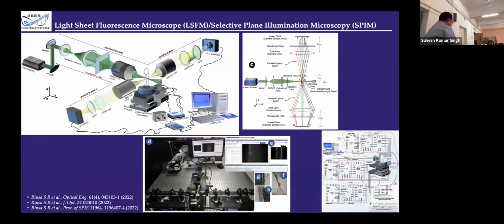So with this, I would like to conclude the photoacoustic part. And now I will move on to light microscopy. This is our experimental system, which may be a little bit different, with a lot of overlap. We are beam expanding and illuminating over here. What we contribute in the light domain is that instead of just one single arm, we put in two arms. If these two arms are fitted with different magnifications in the objectives, then we can get multiple magnifications of the same imaging frame of the sample.